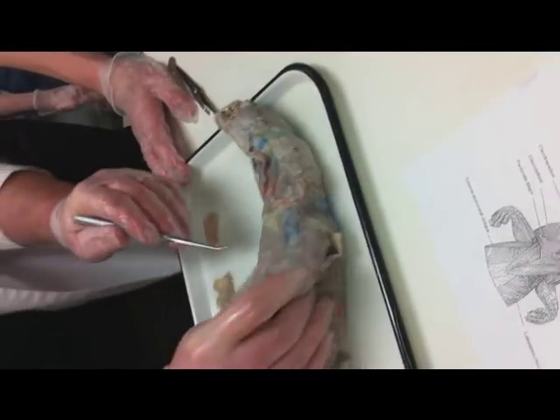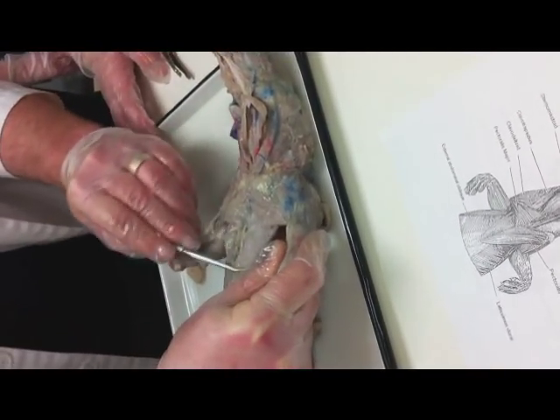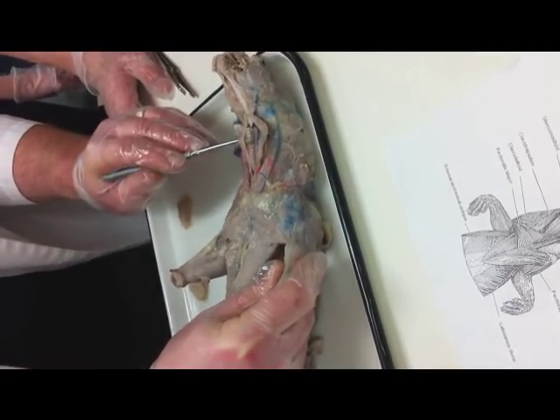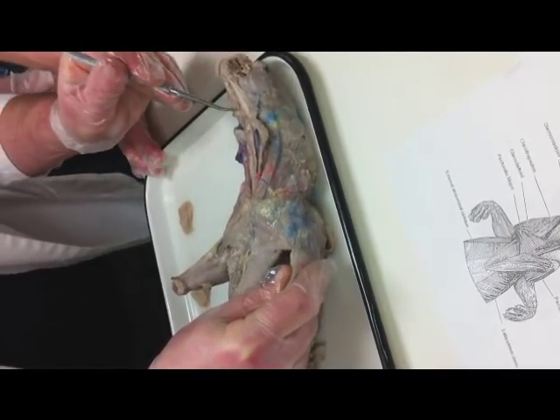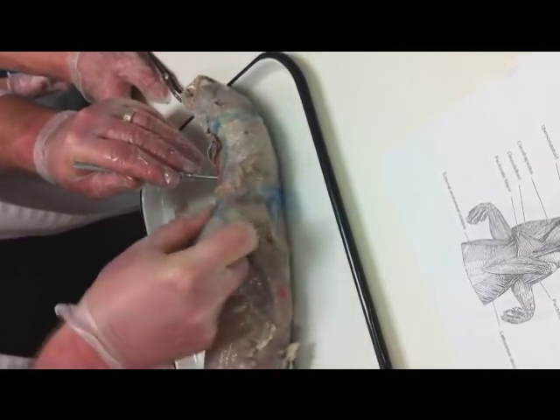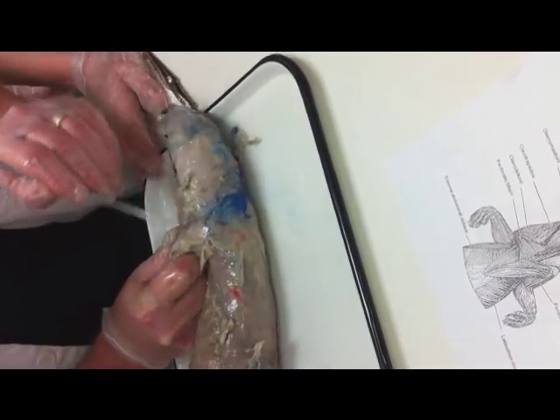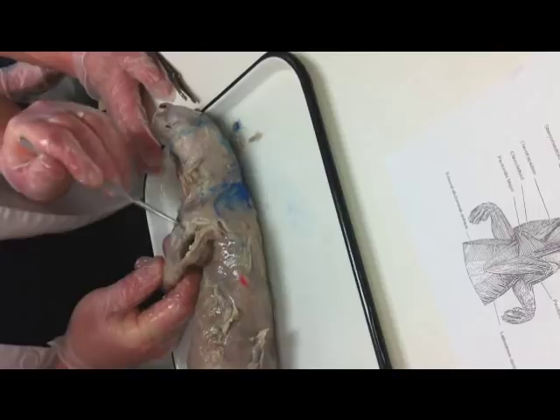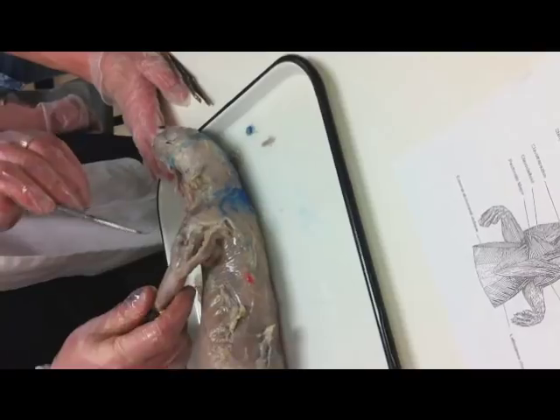So let's review. Pectoralis major, here. Pectoralis minor, sternohyoids, sternomastoids. I have that reversed. Sternomastoid, sternohyoid, sorry. Trachea, esophagus underneath. Digastric, mylohyoid here. Mandibular gland. Masseter, temporalis. Clavotrapezius, acromotrapezius, spinotrapezius, latissimus dorsi, dorsoepitrochlearis, triceps long head, triceps lateral head. And that's the upper.